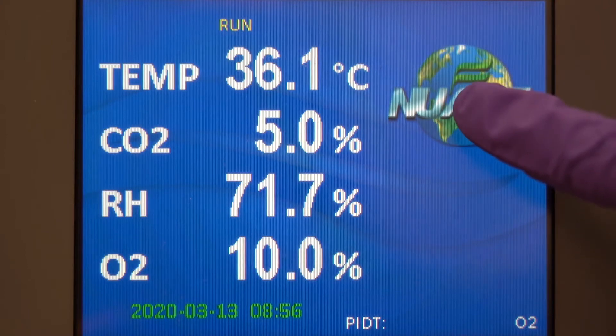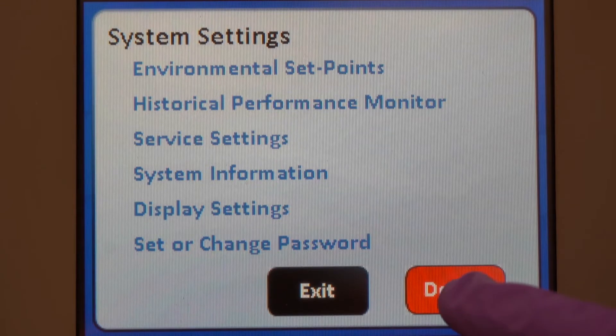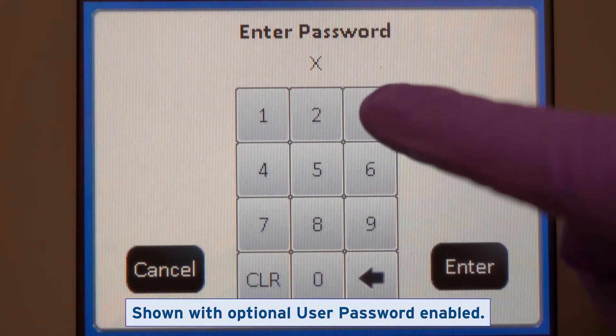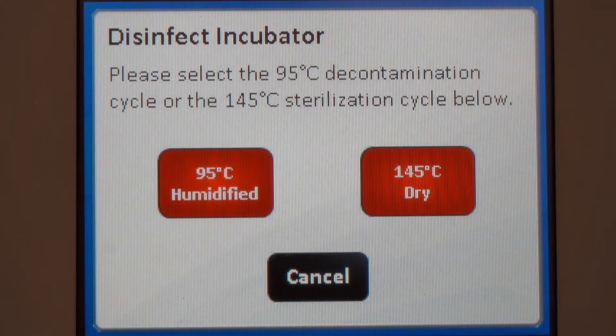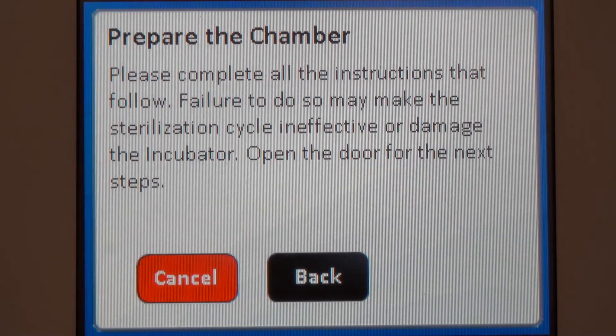Enter the System Settings menu to reach the Disinfect Incubator screen. Choose 145C Dry. Follow the on-screen prompts as they guide you through this process.